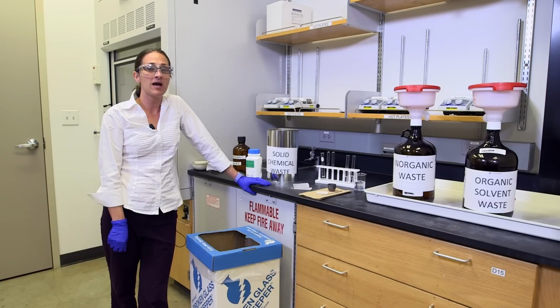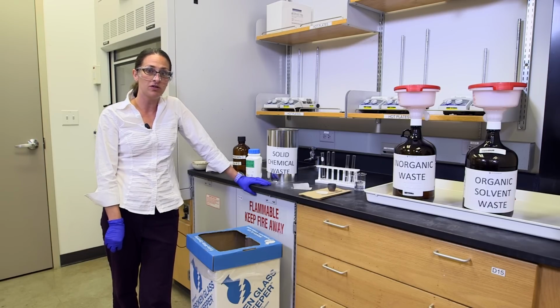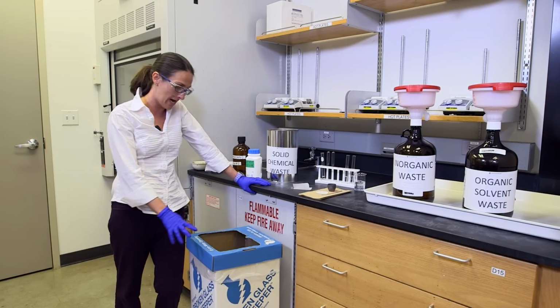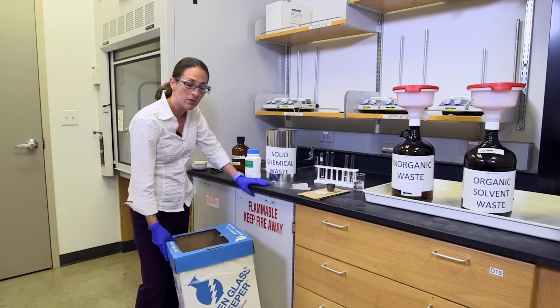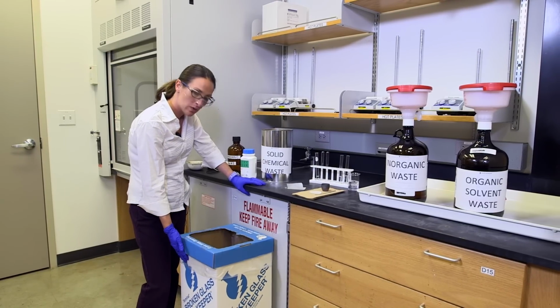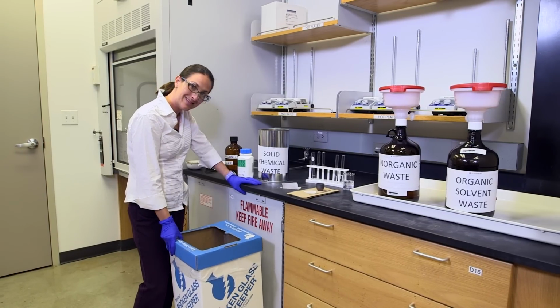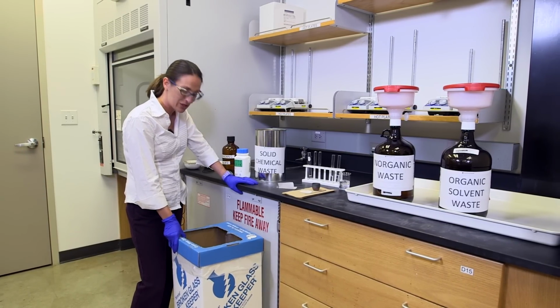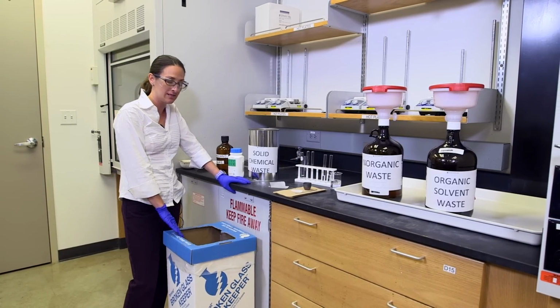Now that you've completed your lab, it's not time to go yet. We're really careful about how we dispose of things. And the first thing I want to talk about is broken glass. Every lab has one of these containers. It's a blue and white cardboard box that's lined with a plastic bag. And let's see what's in here. Graduated cylinders that are broken, beakers, thermometers, any kind of broken glass has to go in this container.